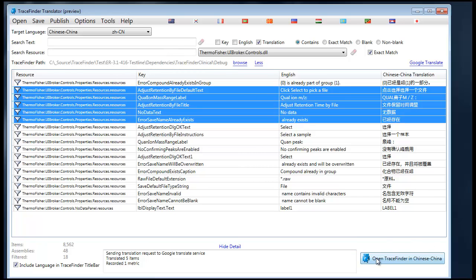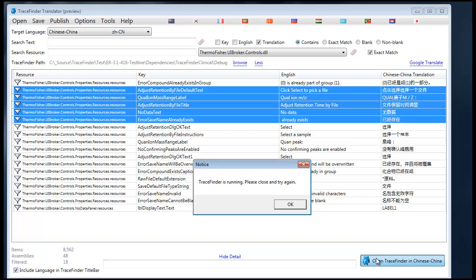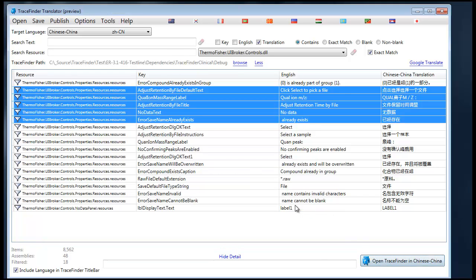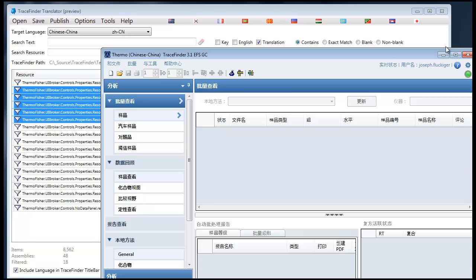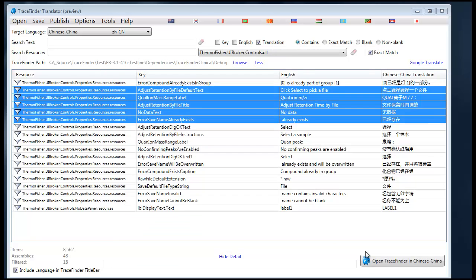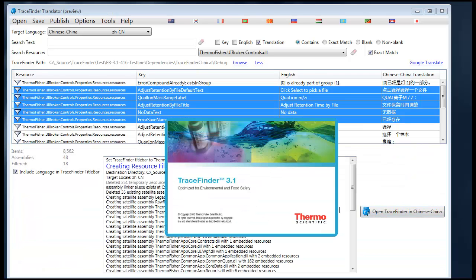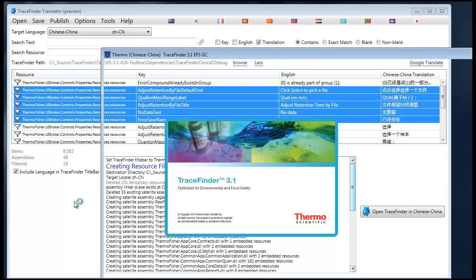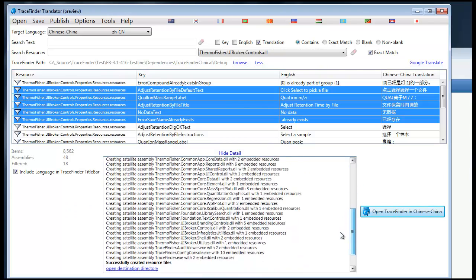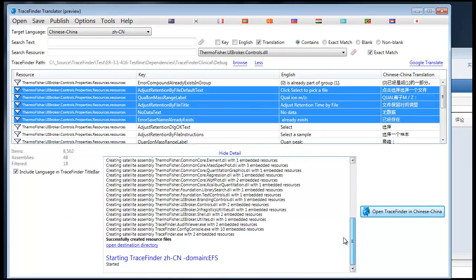Also, when you are opening TraceFinder in Chinese, obviously if TraceFinder is running it cannot produce the translation files. So close TraceFinder and try again. This will generate the resource DLLs, put them in the right file so that TraceFinder knows where to look for them, and then open up TraceFinder. And you can get that detail here in the detailed dialog.